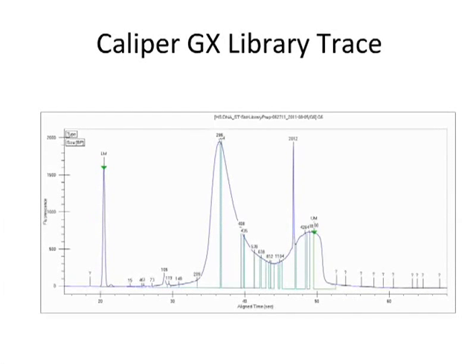And what we found is we also would see libraries that looked like this, where you see the same early steps, but then you see this secondary peak at a much larger size. The challenge here becomes, how do you accurately account for all of the material that is underneath this curve, that would extend from here to over here, into your quantitation schemes, because the key thing is all of that material actually sequences just fine. The reason for that secondary bubble peak occurs when libraries are over-amplified, most specifically when the primer in the PCR reaction becomes limiting.